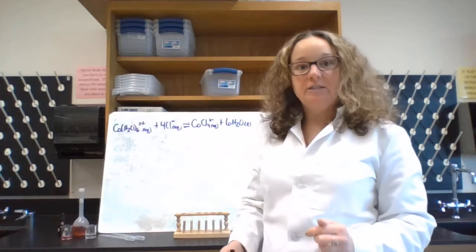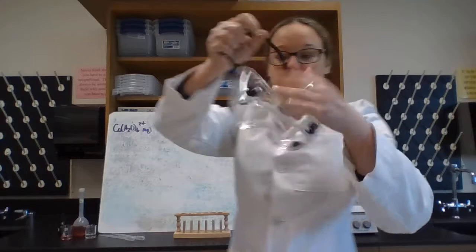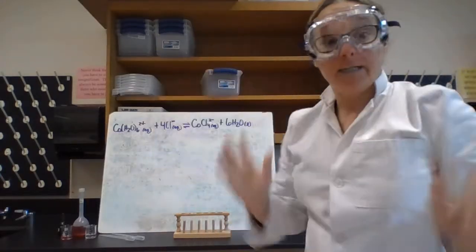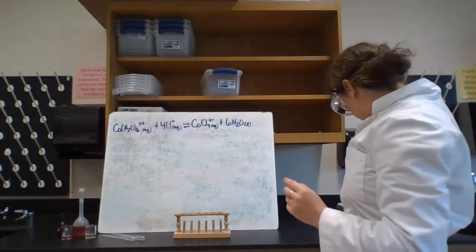Hey guys, so today we're going to do a demonstration to show Le Chatelier's principle in action. So, safety as always. Got the hair pulled back, we're going to put on our goggles. And we are going to need the hot plate, so I'm going to go ahead and turn it on to get it heated.